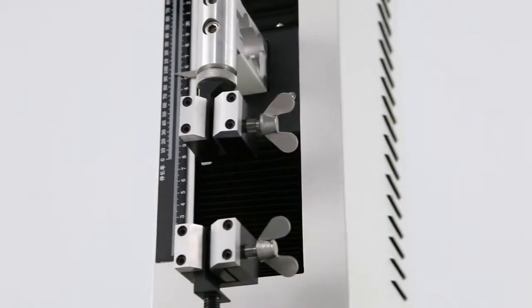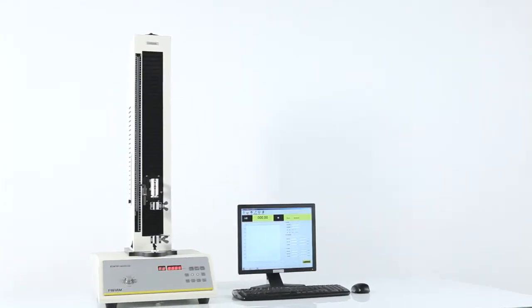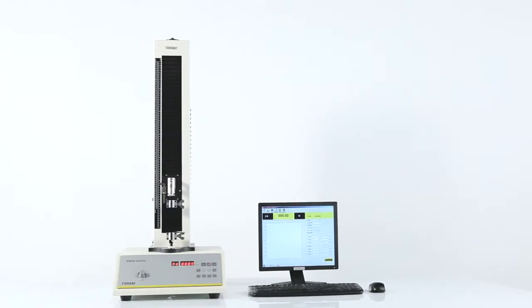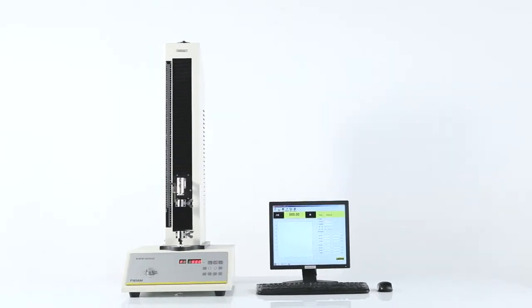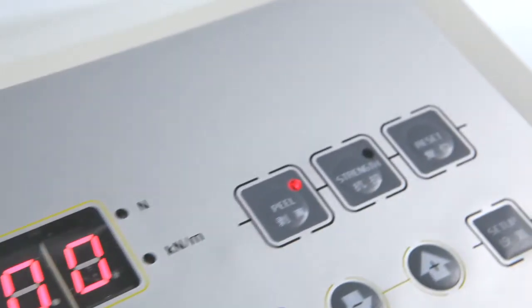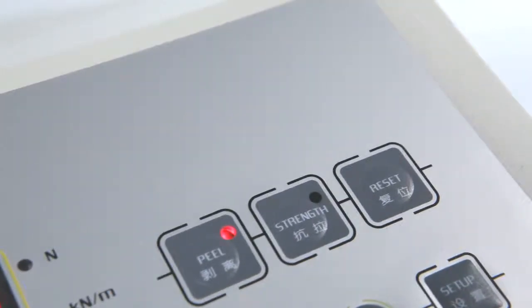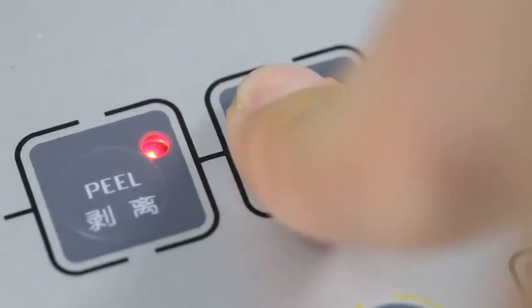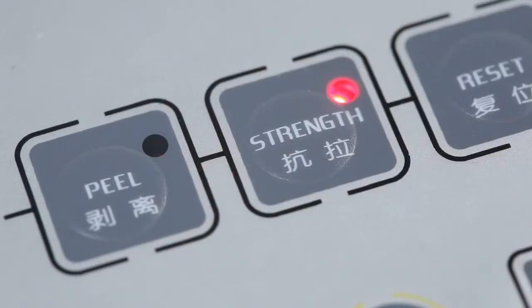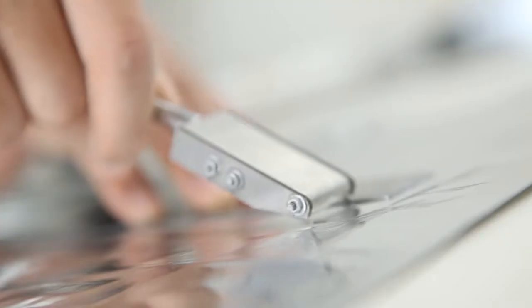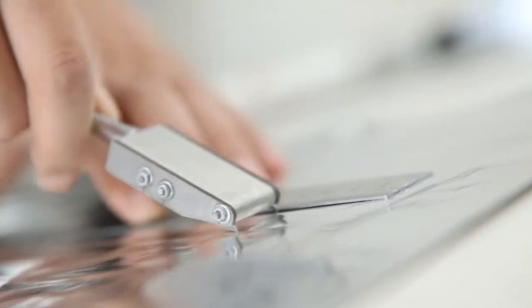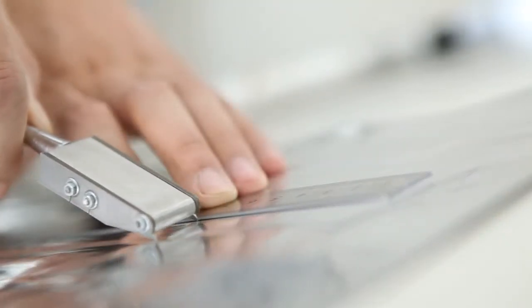XLWB is the basic model of LabThink's automatic tensile testers. Its tensile and peeling testing programs can be easily switched between and can be used to measure the mechanical strengths of flexible plastic packaging materials.